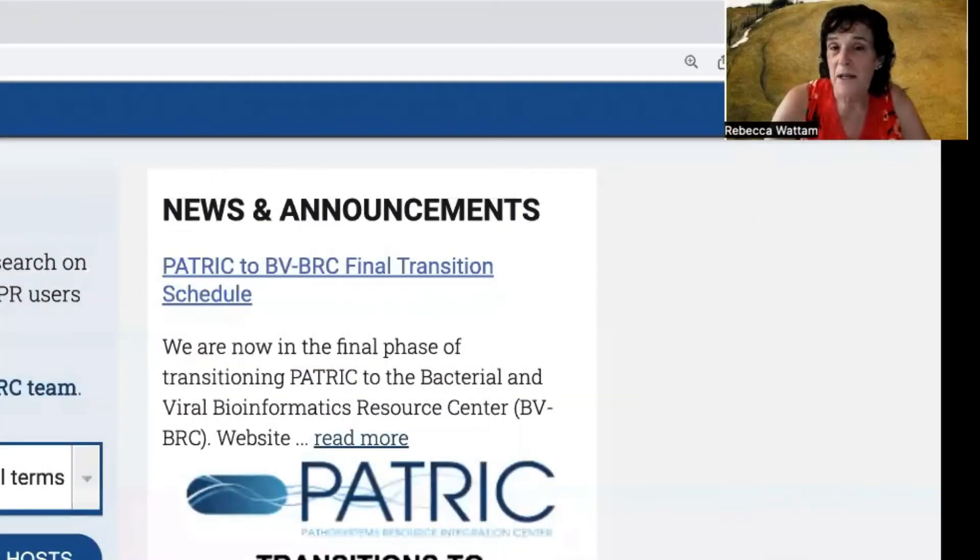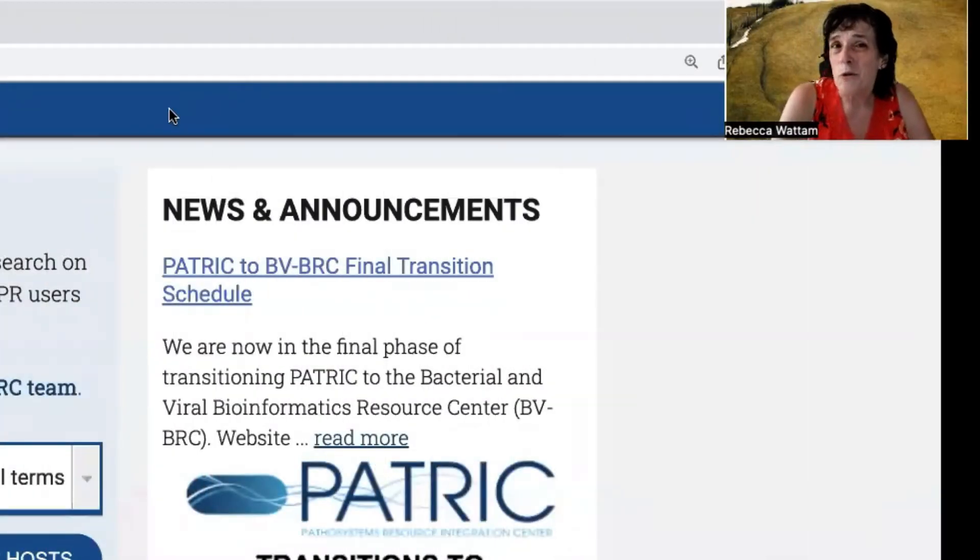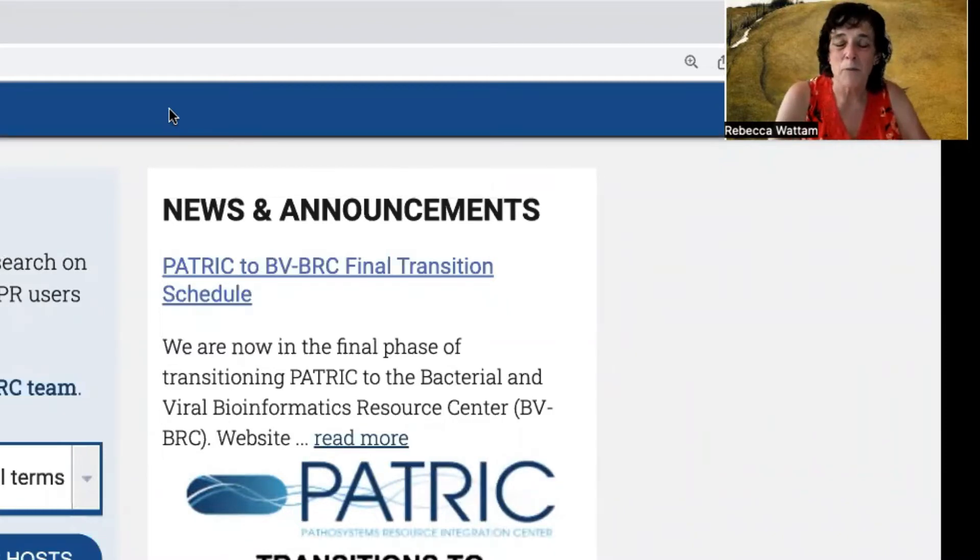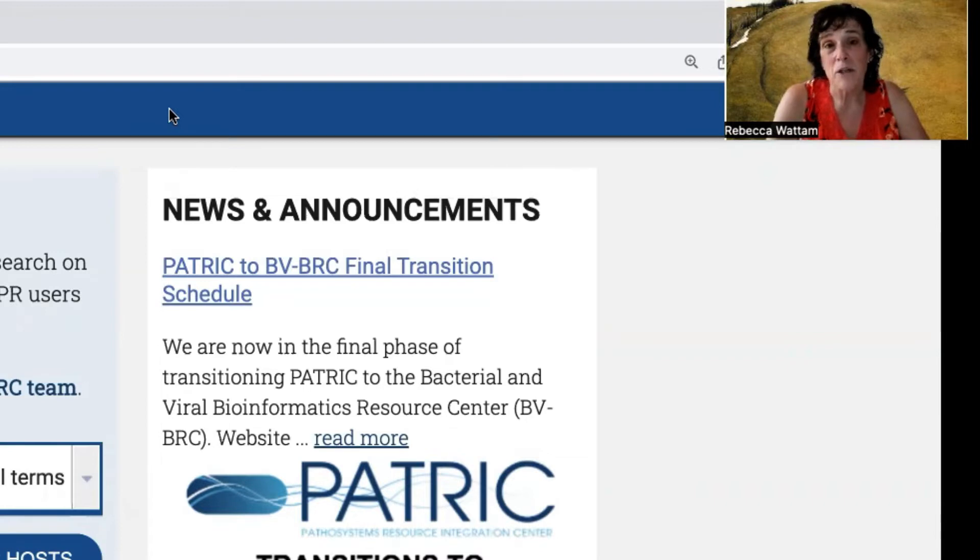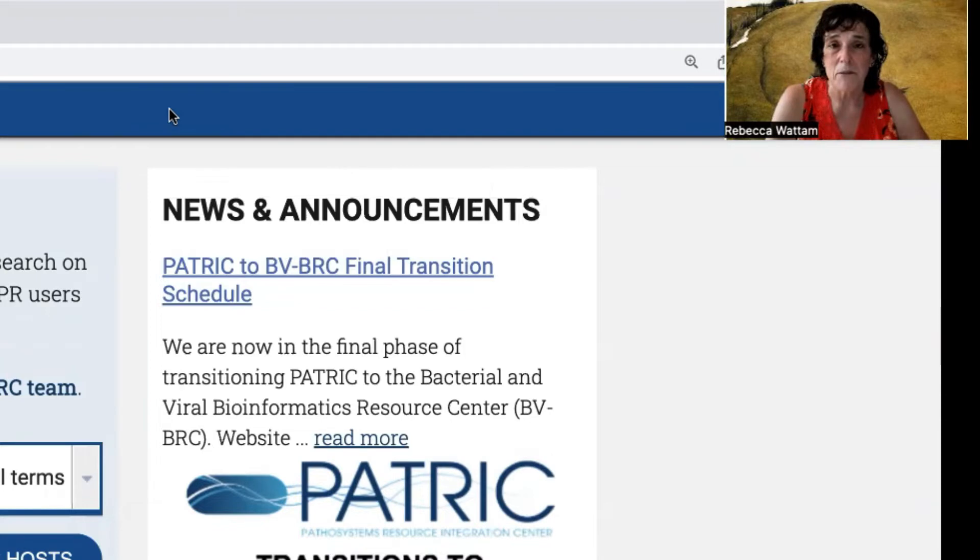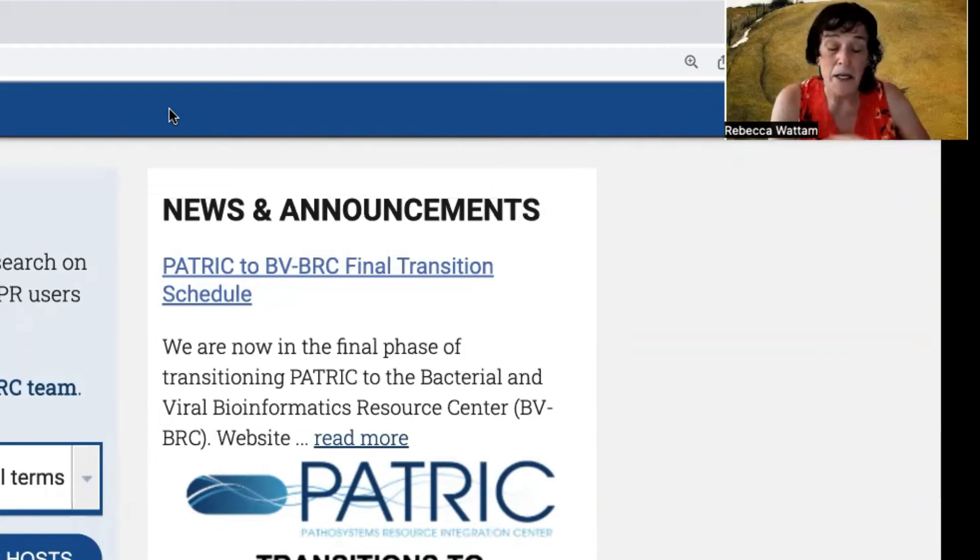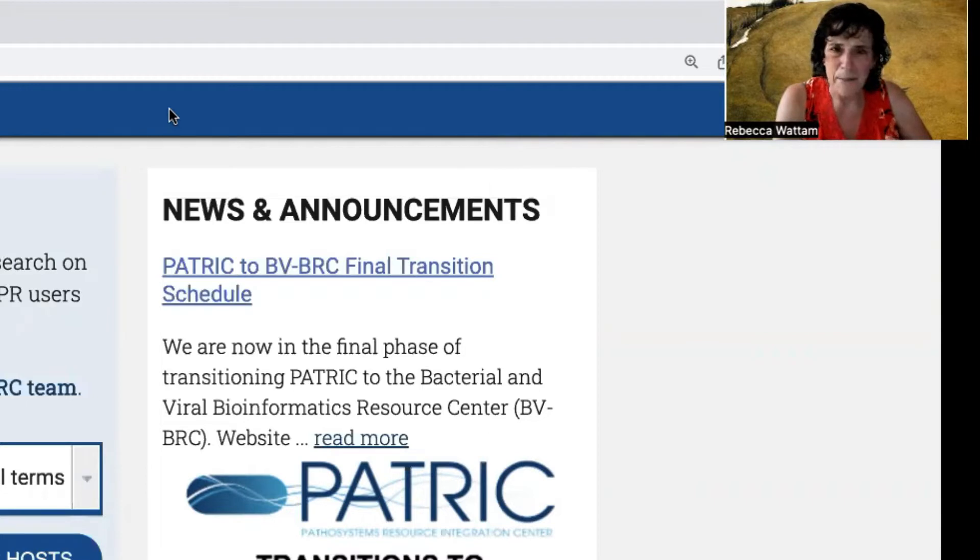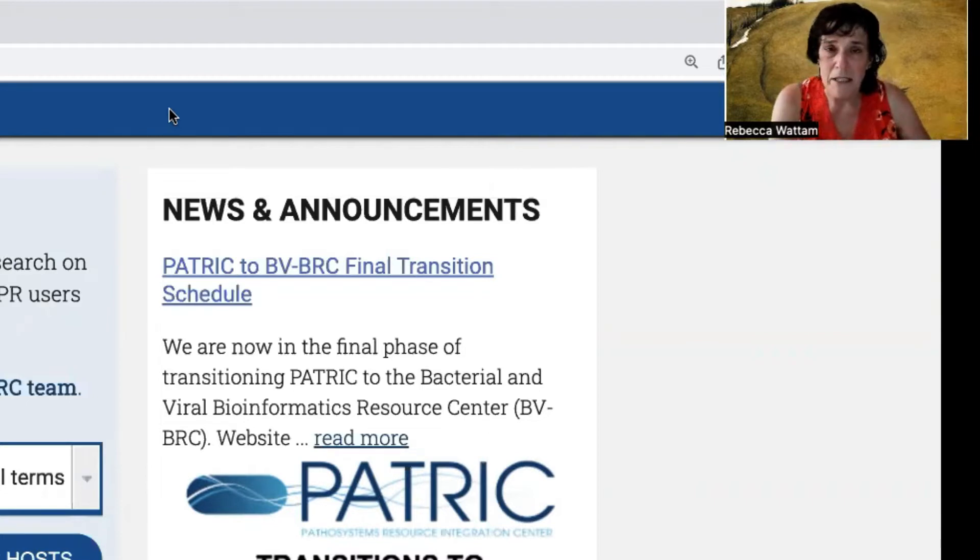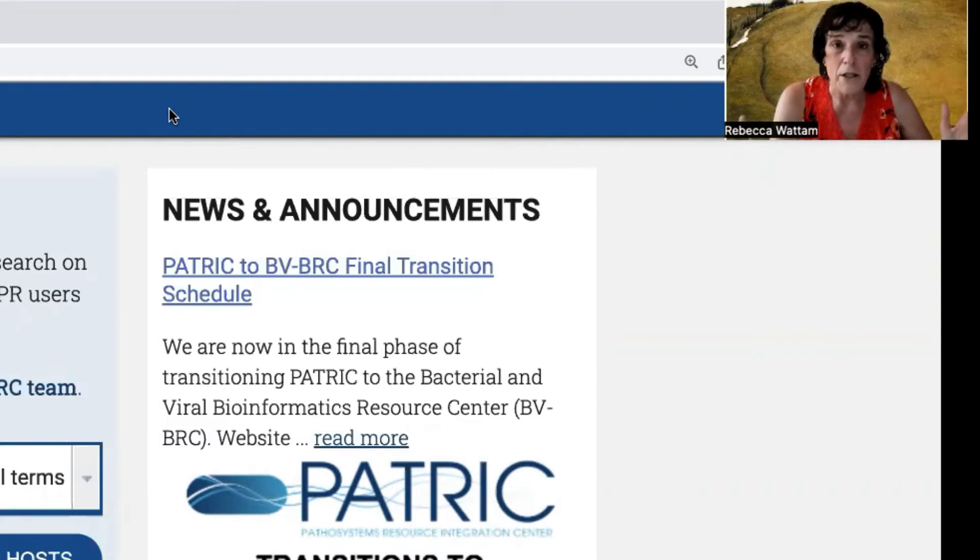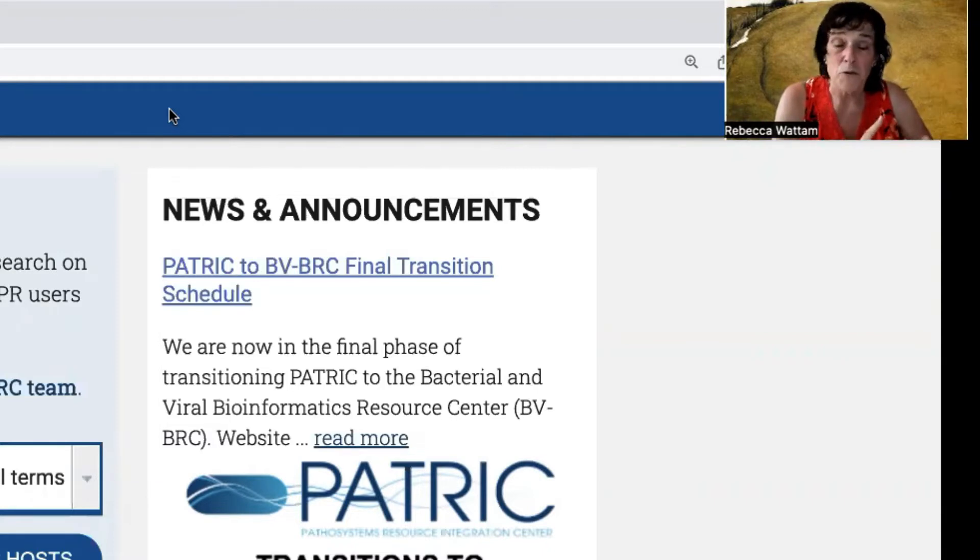Hi, everybody. I'm going to show you a tool that I've been using a lot lately that's been able to help me actually do some pretty amazing things and save some samples that I thought I was going to have to do something drastic with. So let's say you can see that your sample is contaminated from using taxonomic classification and you don't know what you can do with it. Well, there's one thing you could do.